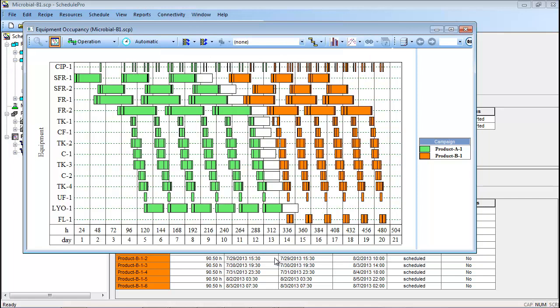In addition to the green and orange bars, notice that there are white bars immediately following the Product A campaign. These represent the 24-hour changeover for each equipment item following the Product A campaign. Notice that the Product A campaign uses the freeze-dryer for its final procedure, whereas the Product B campaign uses the bulk filler. All other equipment is used by both processes.